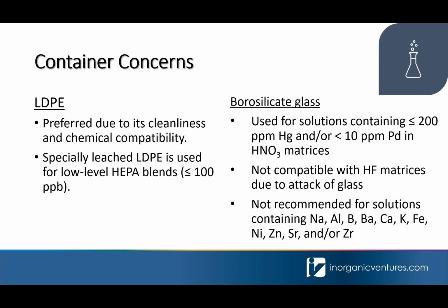Also, you can have issues with HF and glass sample introduction systems. So it's the same type of effect where you'll leach boron and silicon from your sample introduction system, and then you'll see your background increase for those elements, and it will ruin your results if you're trying to analyze those particular elements.